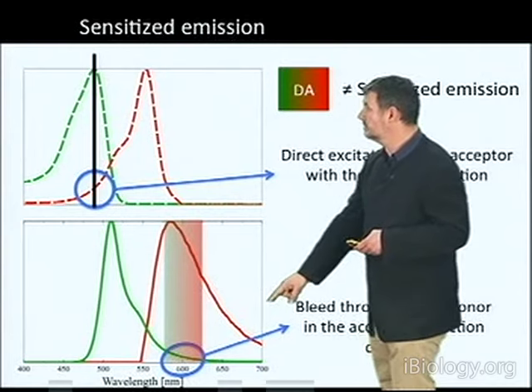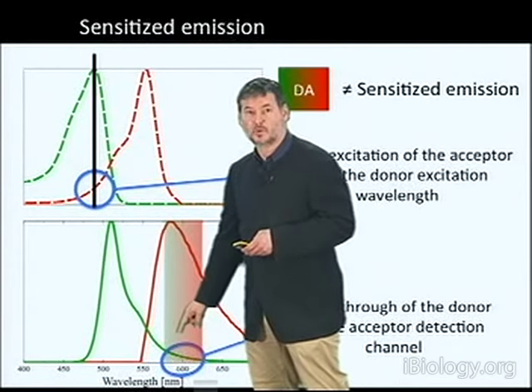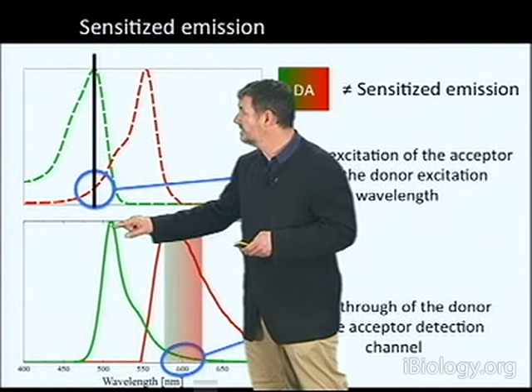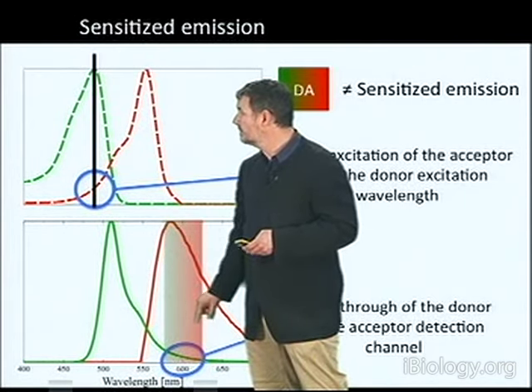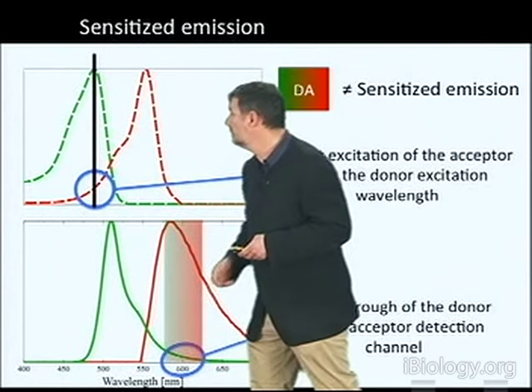Exactly the same situation with the donor bleed through. We cannot measure in a sample where we have donor and acceptor, because we have the emission of the acceptor. But we can measure the donor specifically. So if again, we would know that relationship, this ratio, by measuring here, we could determine how much is there, as long as the spectra, the shape, is invariant.